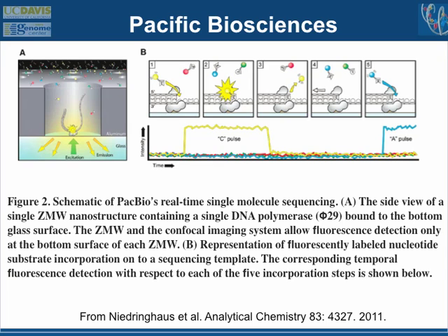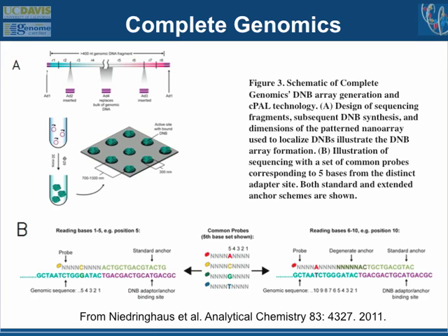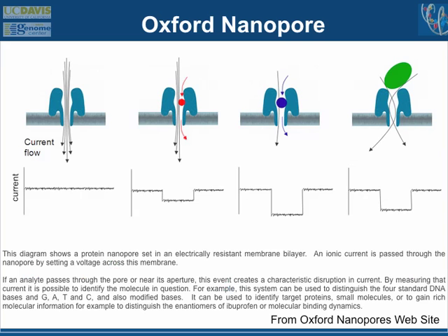People apparently are also using it to do single RNA sequencing. So there are lots of cool adaptations to the PacBio machine that are not just sequencing per se. And that is probably why a lot of people are playing around with it, even though the sequence data that is coming off of it is not anything to write home about. And it's still kind of cool, but I'm going to just skip over this. There's a company called Complete Genomics that has a method, because I want to get to this last one, which, if this actually works, we should all buy stock in this company.